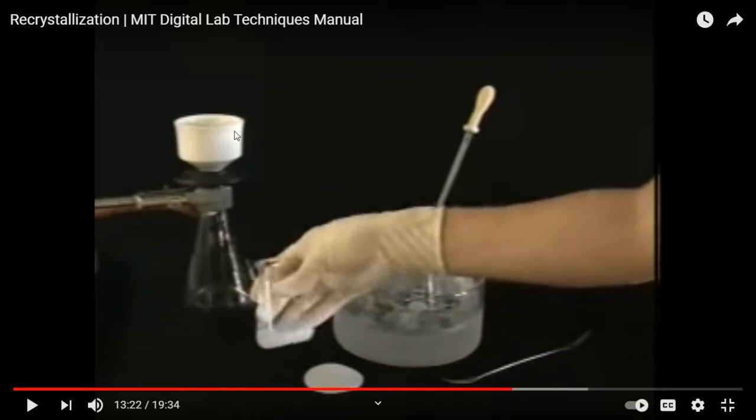The reason for you to wet the paper first is because paper, when it's dry, is always making little gaps between the paper and the bottom of the inside of the flask. Also, the right size of paper is the paper that sits inside without touching the wall, meaning it has to be exactly the right diameter or a little smaller, but it must cover all the holes here.